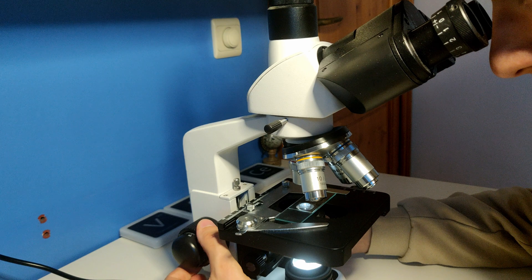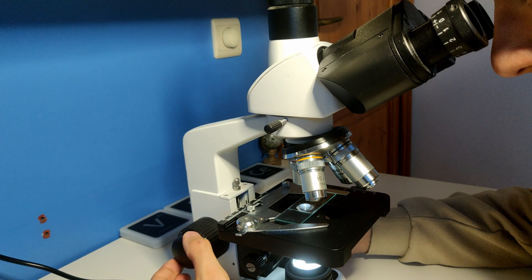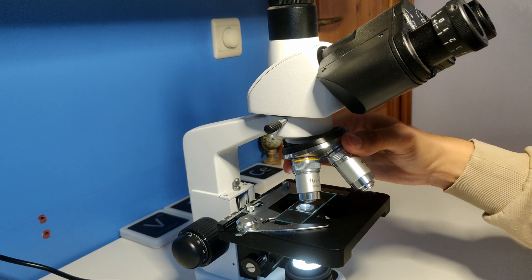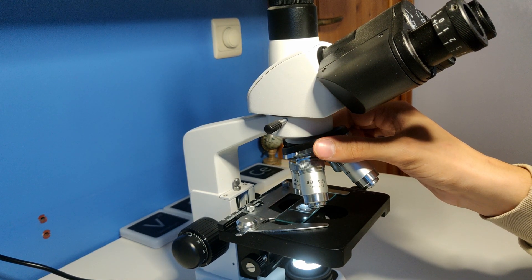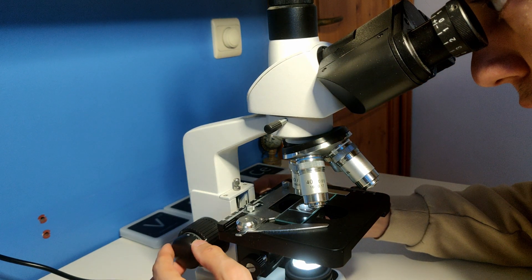It does not have to be completely sharp yet. Focus the image with the fine adjustment. Once the image is in focus for one magnification, it will remain visible for other magnifications as well. When changing the lens you only have to turn the fine adjustment a little more to sharpen the image. You definitely shouldn't turn the coarse adjustment anymore.